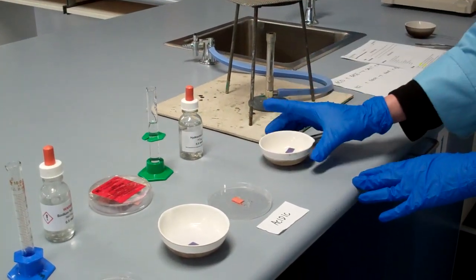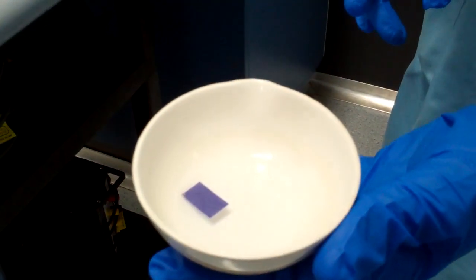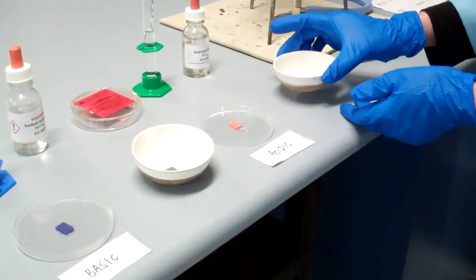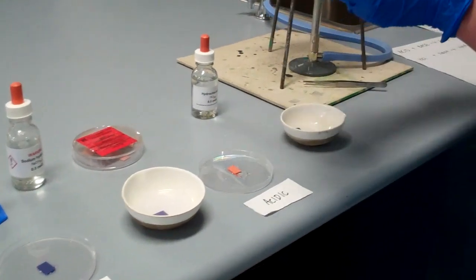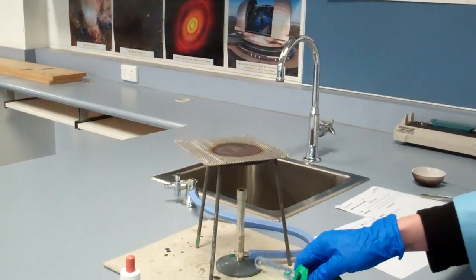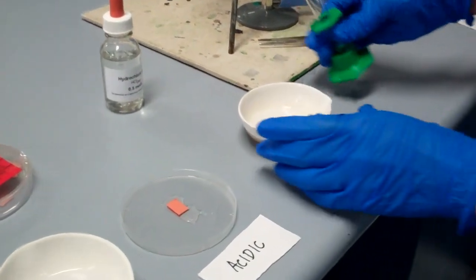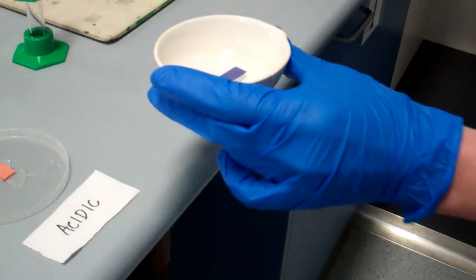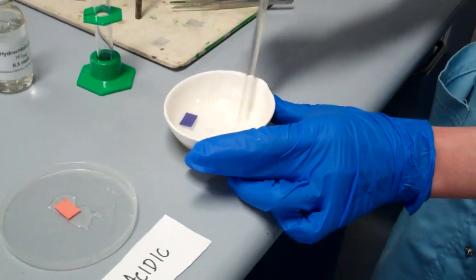You need to note the color. So the starting color is dark blue or bluish purple, and when you add the acid in there, you're meant to see the color change of your litmus paper. We will start with 8 mL of your hydrochloric acid added into your evaporating dish together with the sodium hydroxide. At this time, because the acid is still not a lot in there, the color change is not that obvious. So we need to stir it.